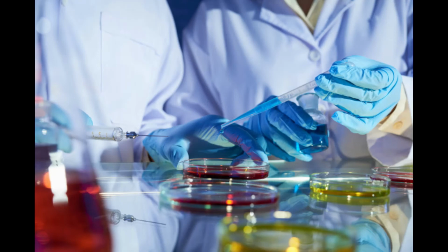But page 47, so a streak plate. The purpose of a streak plate is for dilution. So we're just working with 1 microbe, but what if you had been given a patient sample and you're trying to figure out what's making them sick? It may not be just 1 microbe, it may be multiple microbes. Well, if you just plate their whole sample as 1 giant plate, 1 nutrient agar plate, just rub it all on there, it's all gonna grow on top of each other and it's gonna look like a big mess. And picking out just 1, trying to isolate how many different microbes you have there would be very difficult.